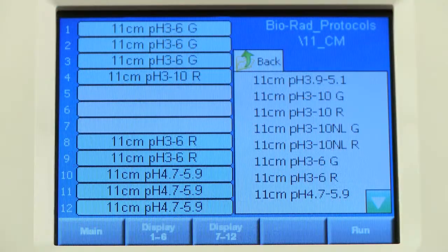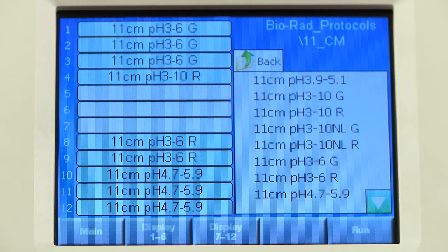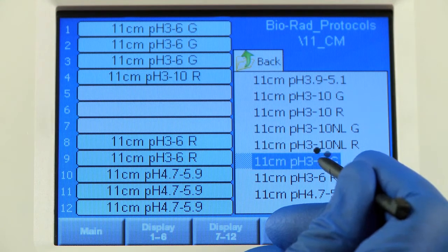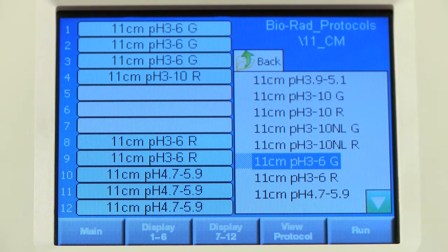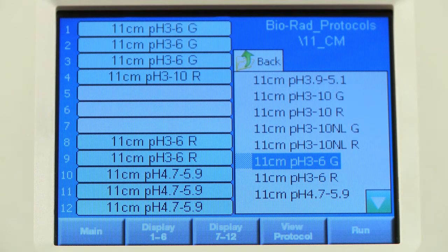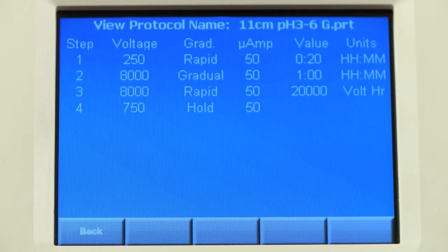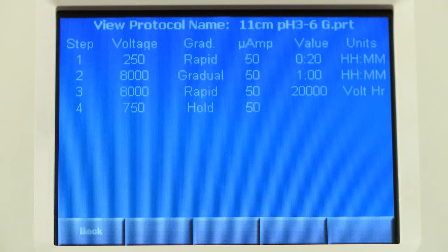If you would like to check a protocol before you assign it to a lane, select the protocol from the list on the right-hand side of the screen. Click on View Protocol. This will show you the protocol that is selected. After viewing your protocol, press the Back button.